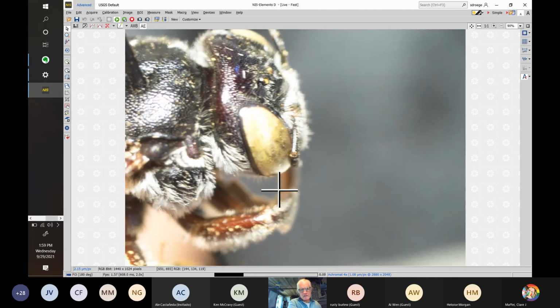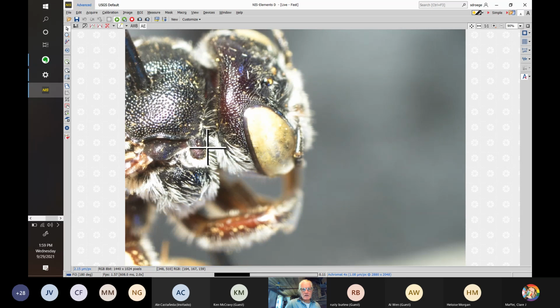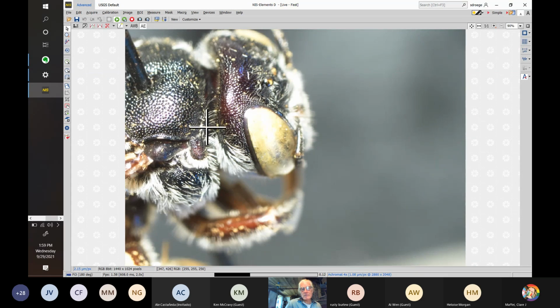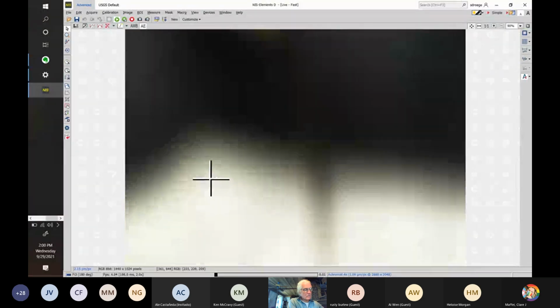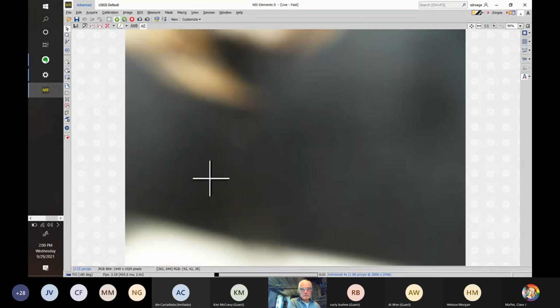All right, let's see if we can see some of these characters a little bit better here. So we were talking about the oval tegula. The pronotal collar is right through here. You can see the whole thing. There's no really raised section to the pronotal angle. The scutum seems to slope down and pretty much meet the edge of the pronotal collar. I don't see any on the side. I don't see any notion that there's an angle between the two plates.